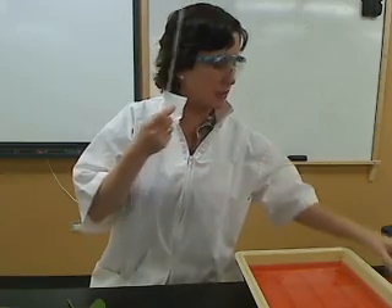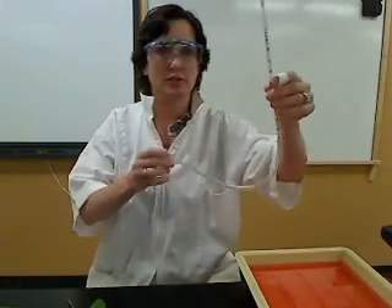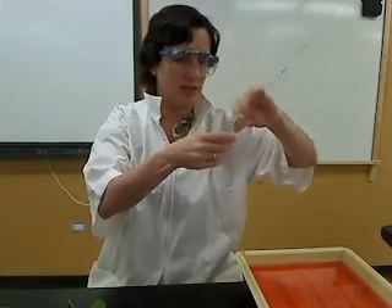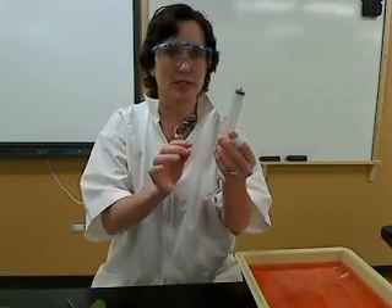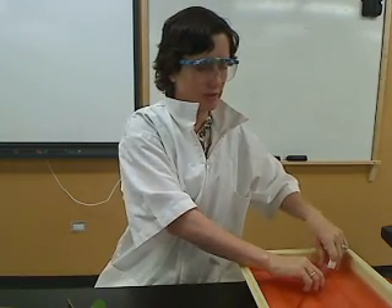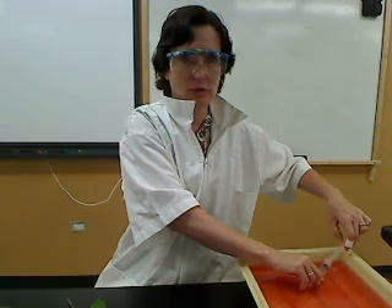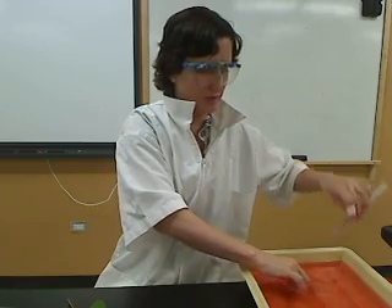We put a little food coloring in the water so it will be easier to see the water go through the tubing. What you want to do is put your glass tubing and your plastic tubing together — be gentle with that — and then place it in this water. Take a syringe, put it into the edge of the tubing, and then underwater go ahead and draw water through. That will fill the tubing with water. Once you've done that, keep it underwater and remove the syringe.